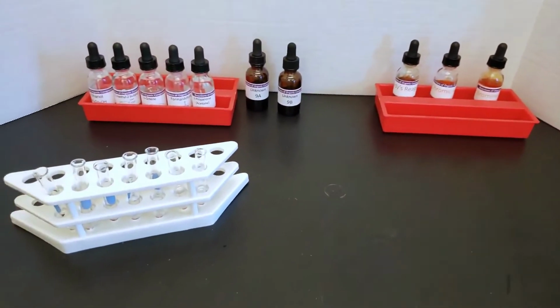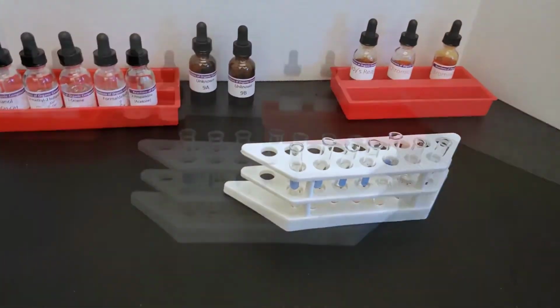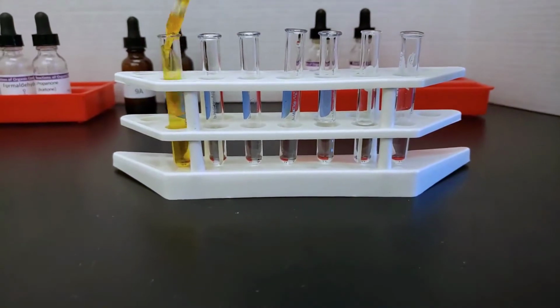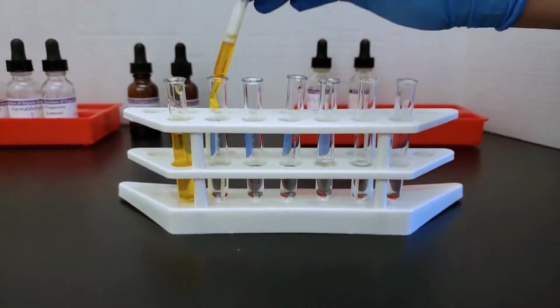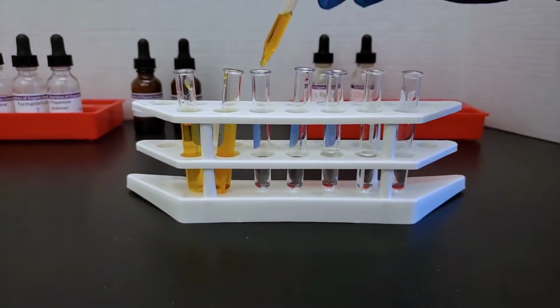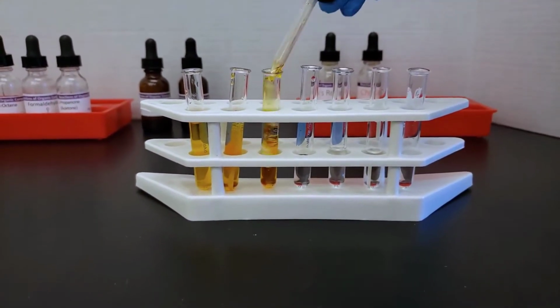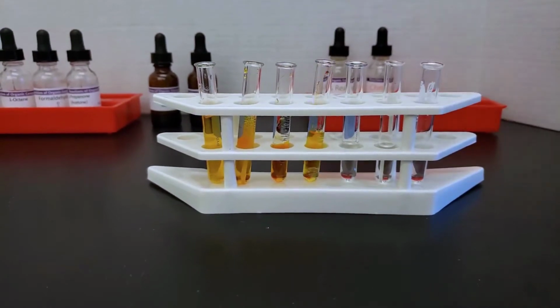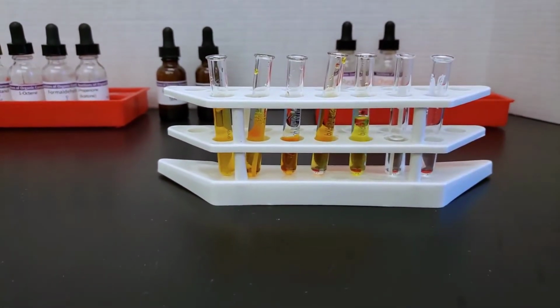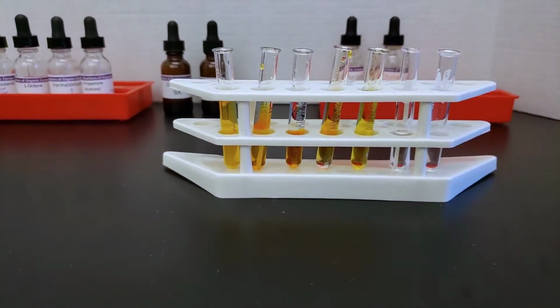Our first test is going to be bromine water. So we're just putting a little bit of bromine water in all of the tubes. Bromine water tests for the presence of a double bond, so an alkene. And what we'll see is with an alkene, the color disappears on reaction with bromine.